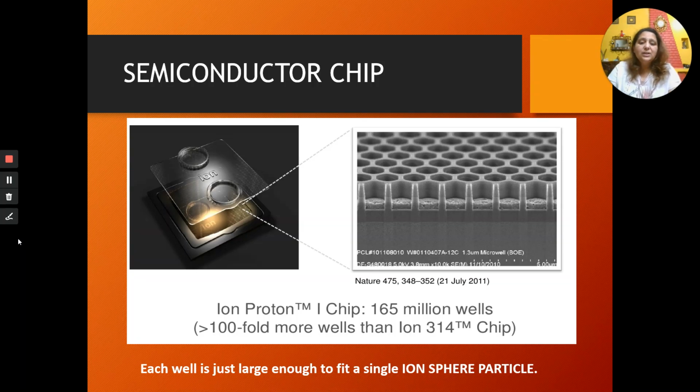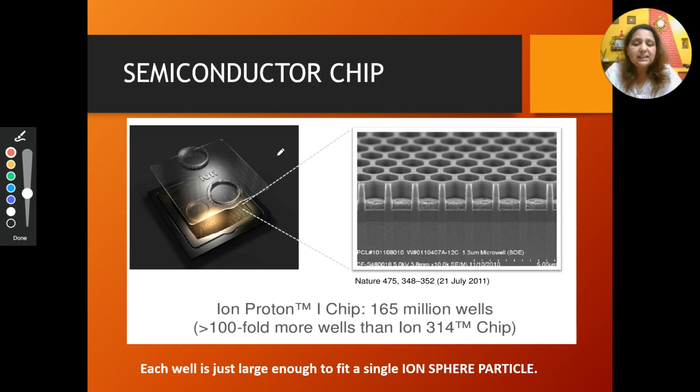Okay, so each semiconductor chip, actually what is there in the chip? Like we had discussed in nanopores, that there were nanoscale holes.